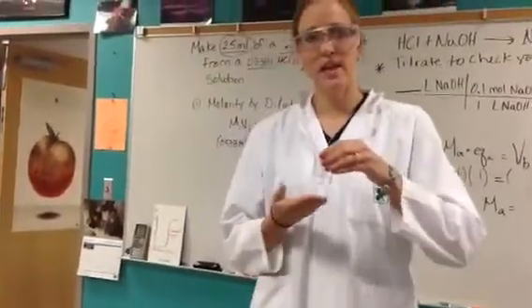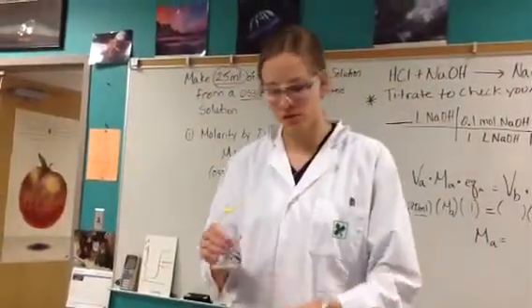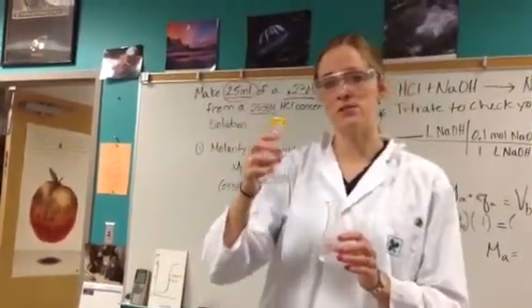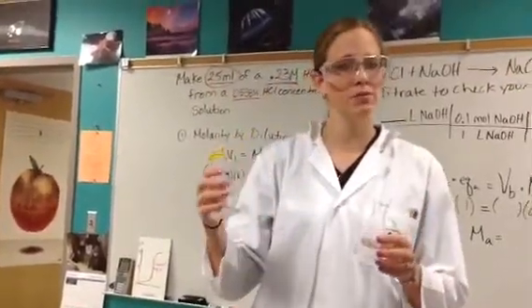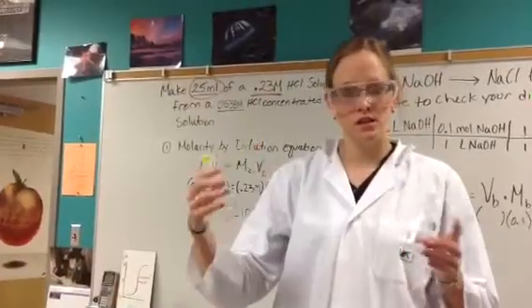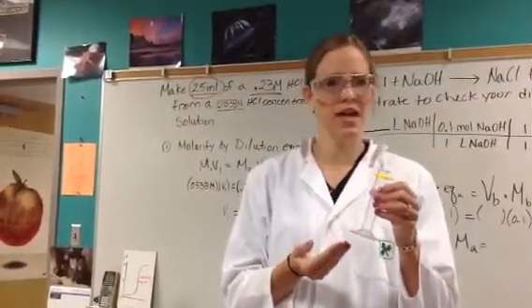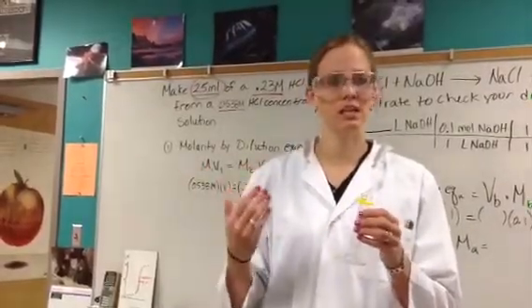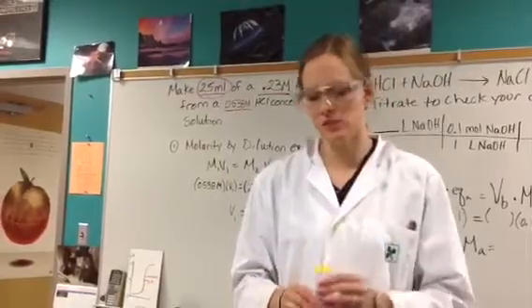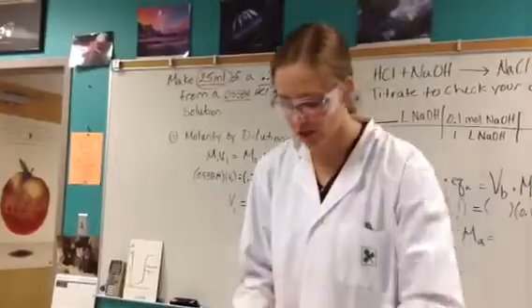When you're done measuring, save your solution because you might have to titrate again — make sure nobody dumps it out. Take your 10 mils of the dilution and pour it into your Erlenmeyer flask. Remember, any time we do a transfer and assume all 10 mils go in, adhesion of the water molecules to the side of the graduated cylinder is going to cause a source of error. Also, the 25 mil graduated cylinder isn't the most accurate measuring device for 10 mils, but we'll use it since we don't have enough individual burettes. Don't forget to add your phenolphthalein or it will never turn pink.